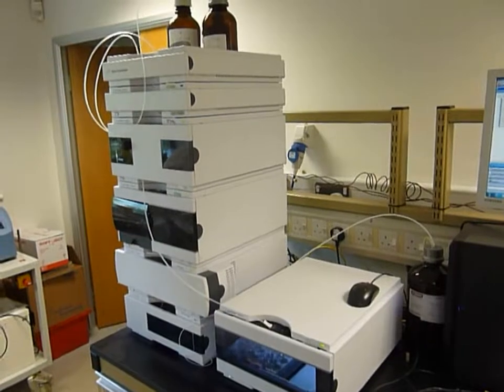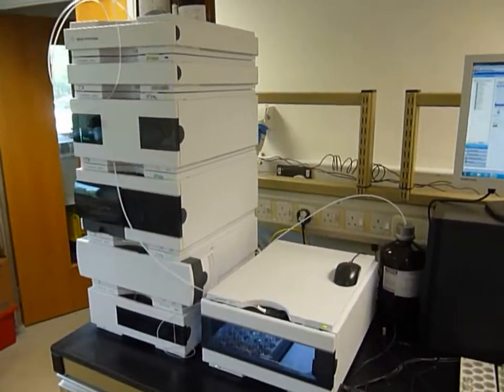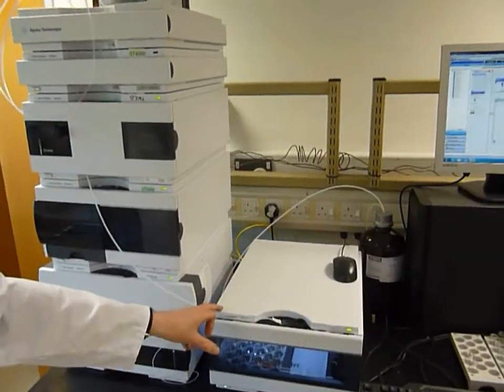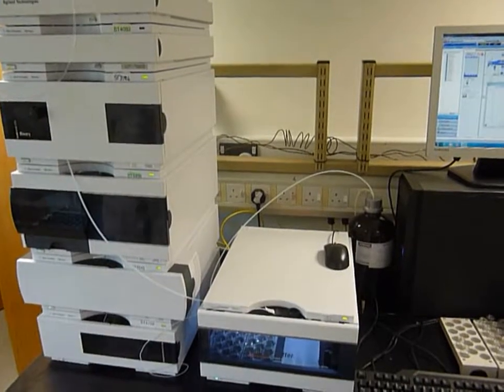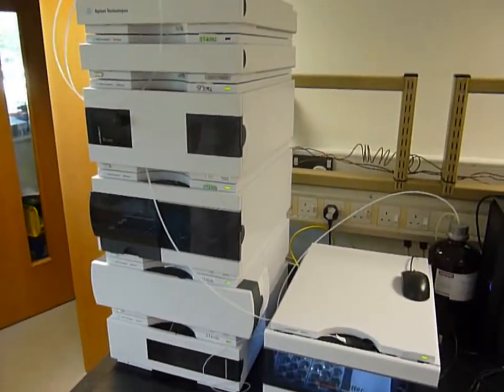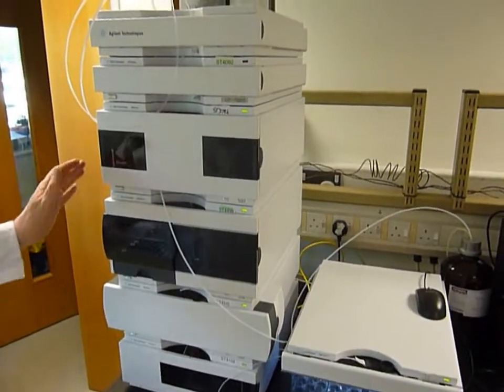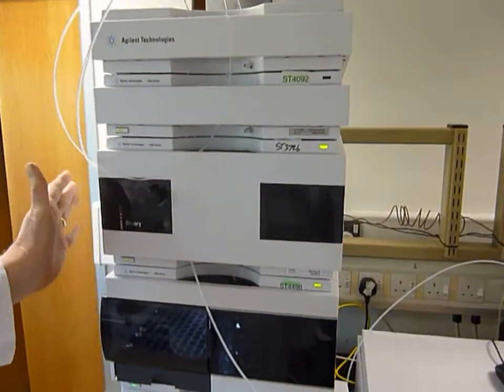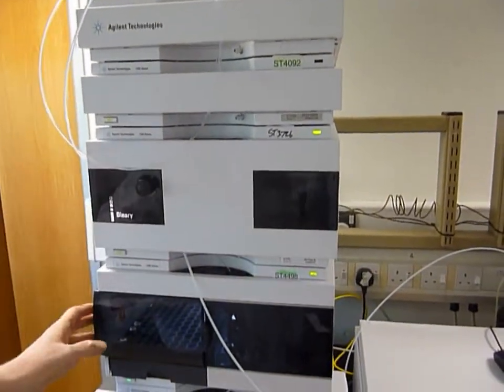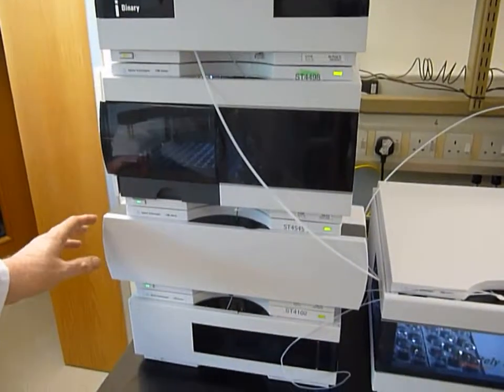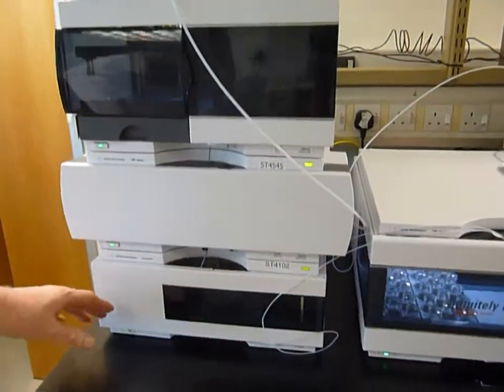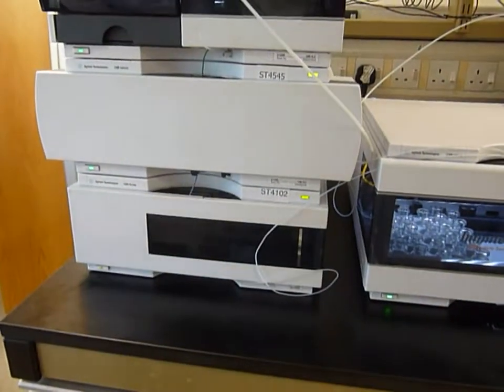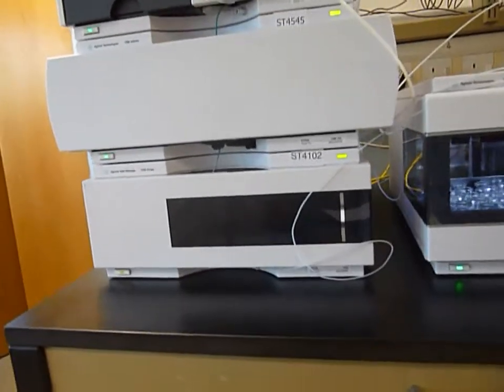This is a nice piece of equipment from Agilent which is the LC with a fraction collector which I'm actually using to collect peptides. It consists of a 1200 pump, a 1260 auto sampler, a column oven, and a 1260 variable wavelength detector.